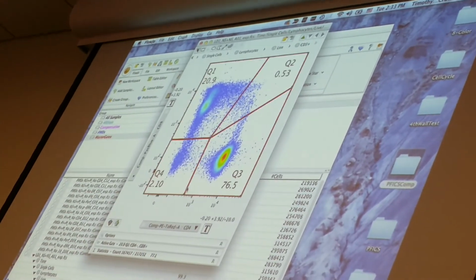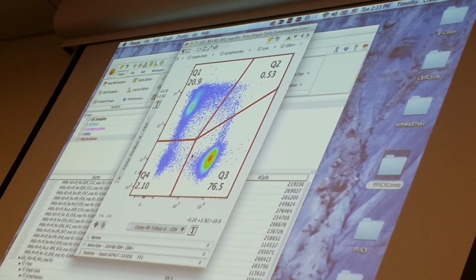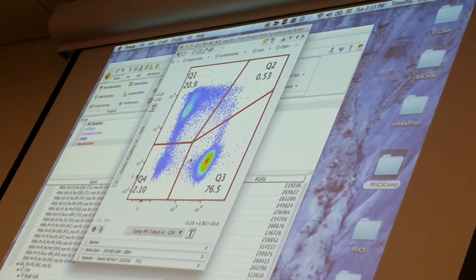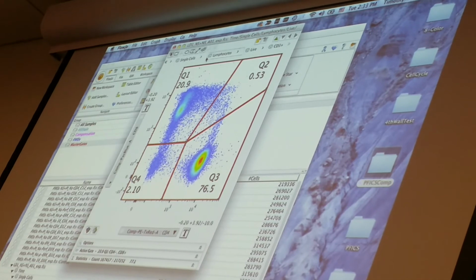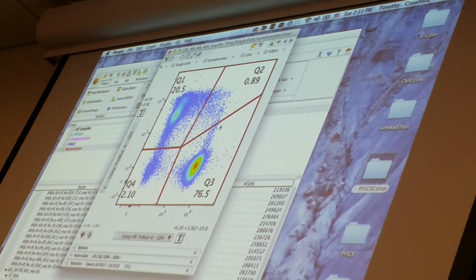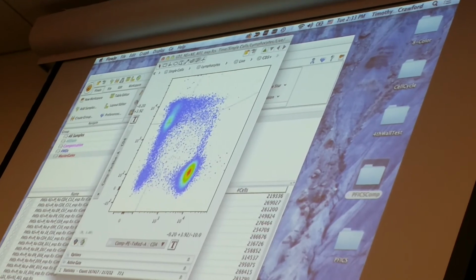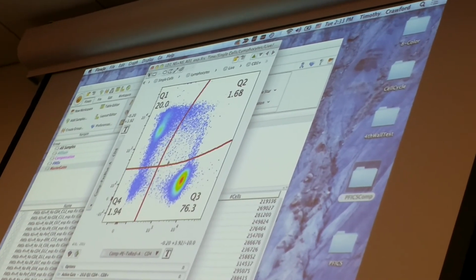Those are really helpful if you have distributions that aren't very well separated, and you're going to have mouse samples or something. You need to make angles that separate the markers appropriately. But for me, it doesn't really matter. I'll just leave this tool in here. Actually, I'm really fond of these curly quads this past week or so. So I'm going to do my curly quad gate.